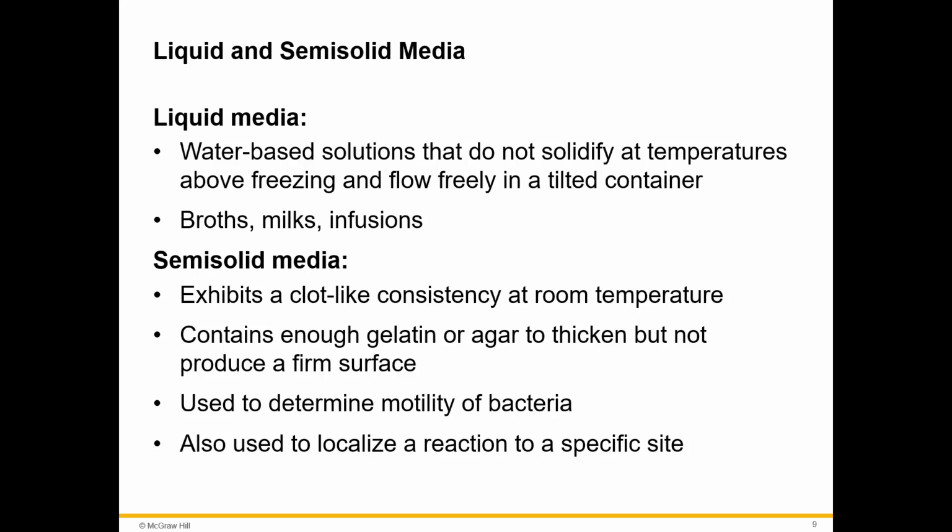So liquid media is water-based. It does not solidify at temperatures above freezing, and they flow freely in a tilted container. Broths, milks, and infusions are liquid media. Semi-solid media are of clot-like consistency. They're kind of like jello, and they're used a lot for determining motility, whether the bacteria can swim or not.